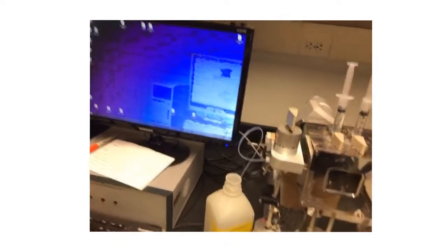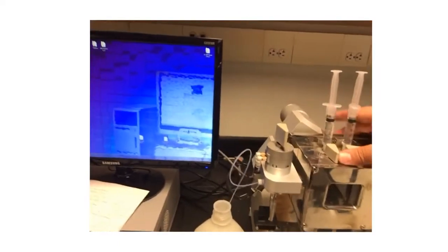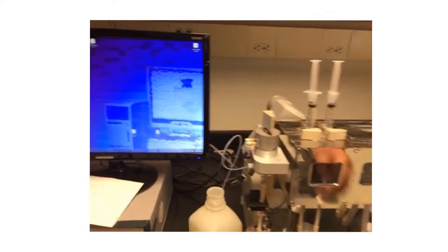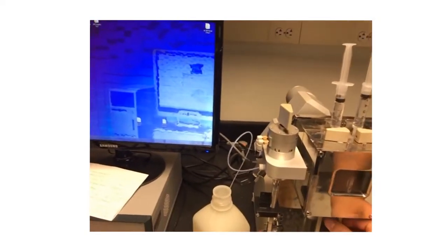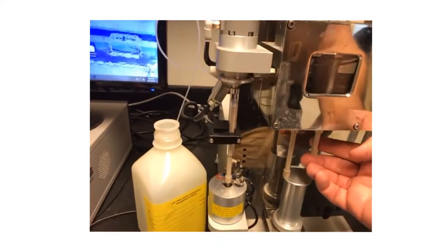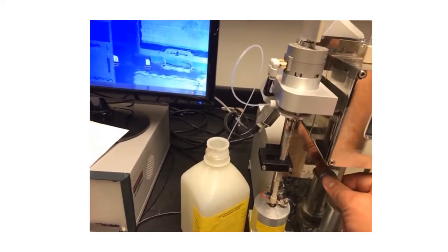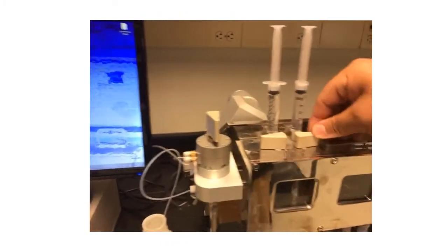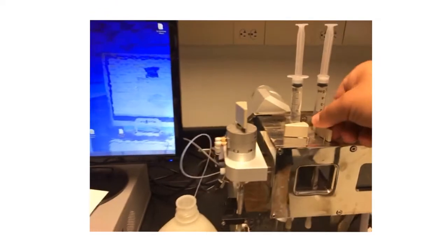So we have our two syringes here. Now one of the things that we usually do is we usually just keep water loaded on the instrument whenever we're not using it. So this is just simply water. We would lift up on our syringes here, and here. I kind of glossed over this, but this is the load position, and this is the lock position.